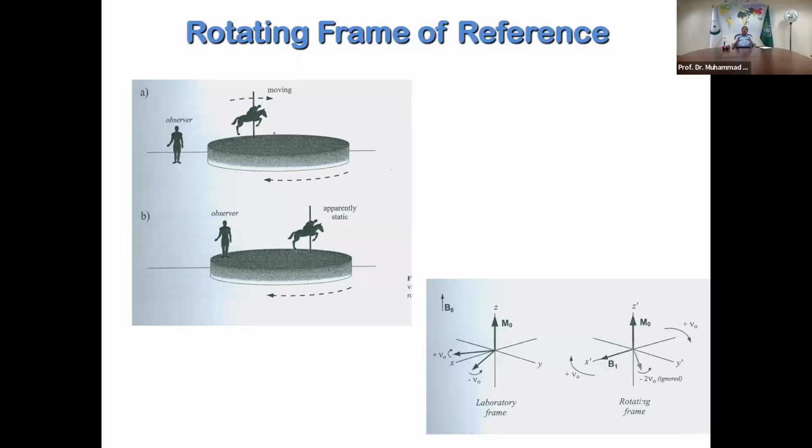This is desirable because in all modern NMR experiments, which are multi-pulse, multinuclear NMR experiments, you need to understand which peak is where on this three-dimensional Cartesian system, on this transverse plane. If you do not develop this concept of rotating frame of reference, you would never be able to understand, if you have three protons, which one is where and what its location is.